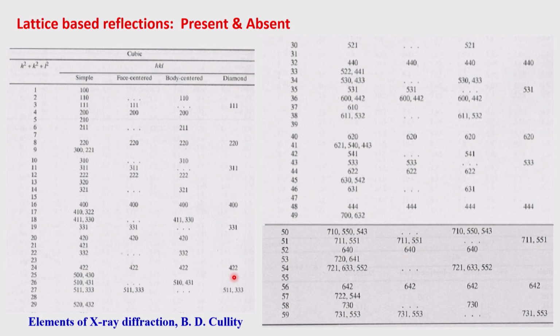Okay, so we are more or less coming towards the end of this particular topic on powder XRD, in specific, and X-ray diffraction in general. I've shown you at one stage that the S value can be calculated by using the sine square theta values, etc., and that is where you can see how they match with what kind of reflections. So that is what kind of indices also.